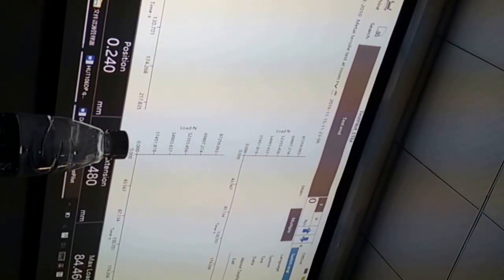So what else? Switch user is when you can switch between the admin and tester and operator 1 and operator 2, etc. This is, I guess, a very brief tour of the software. If you have any questions, you can ask. Just now I asked about the data point.